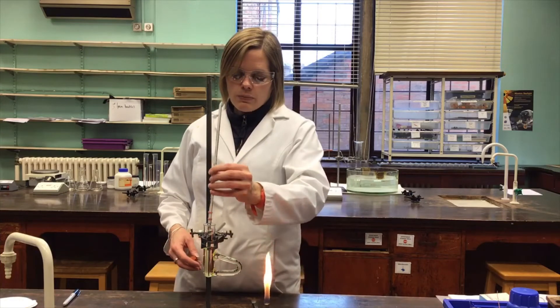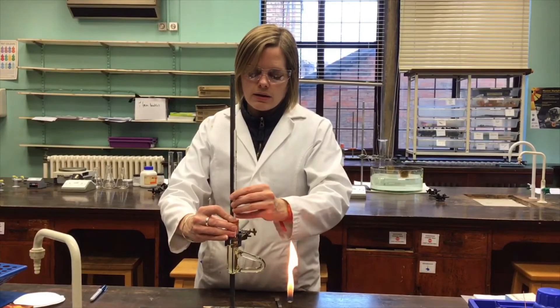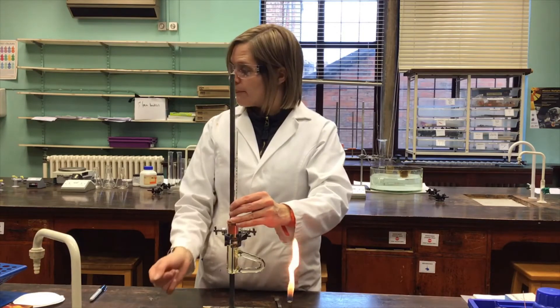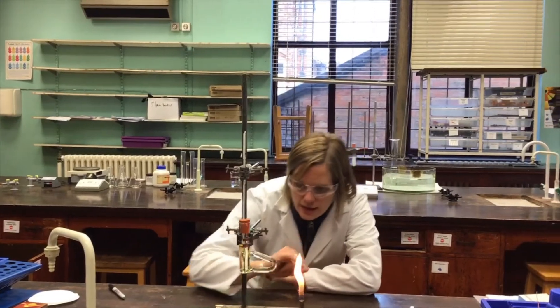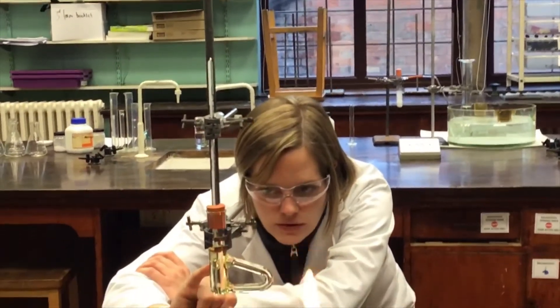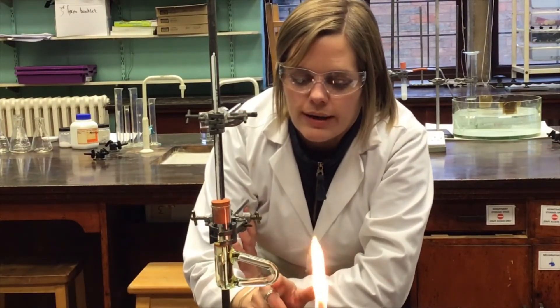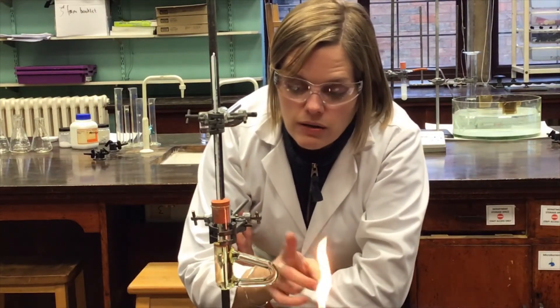I'm going to pop this into a Thiele tube and sit it in there. The thermometer will need a little support from a clamp, so I'll clamp it in place carefully. The sample tube with the aspirin is right next to the bulb of the thermometer. Heating happens on the Thiele tube, where the oil gets hot and convection currents carry it around, allowing for even and gradual heating.